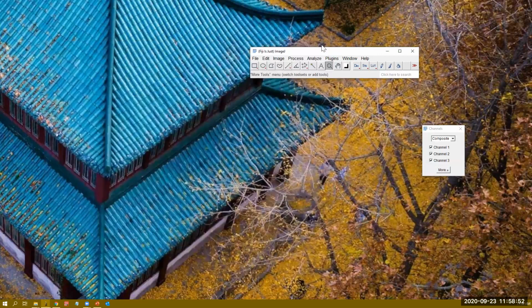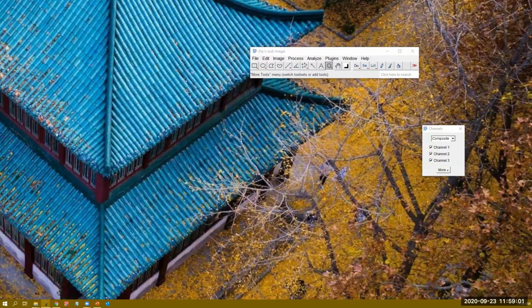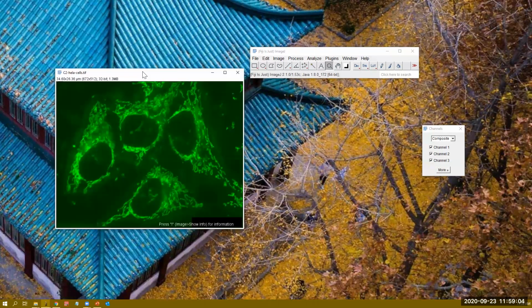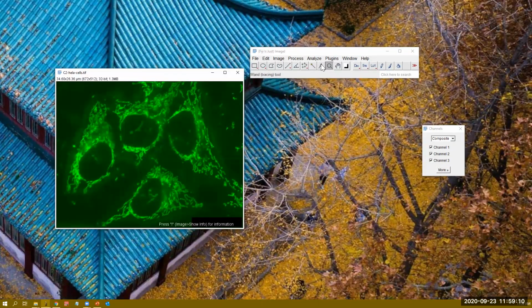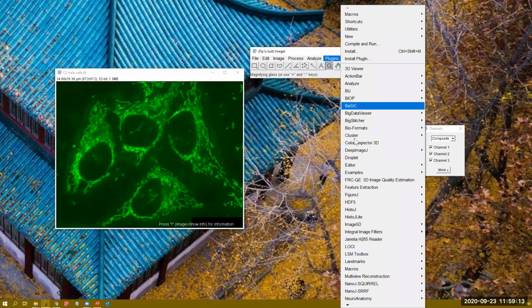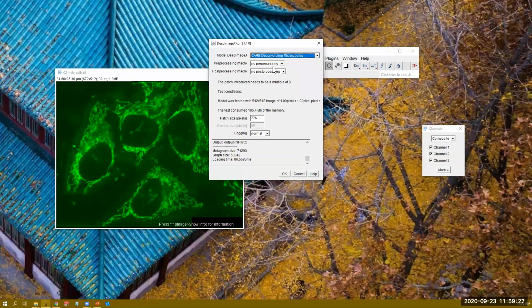So I'll run one more and then we'll call it. This is not exactly an example of transfer learning, but I'm going to run something for microtubules, and this is mitochondria. It is not microtubules, but it even works for this. So I'm going to run CARE deconvolution for microtubules here. The way you learn with deep learning is basically just to mess around, just like everything else.